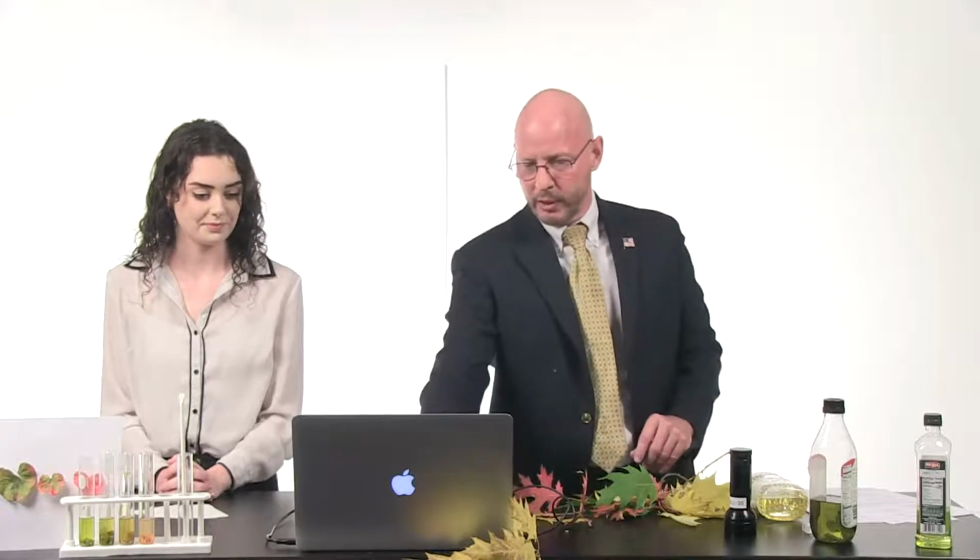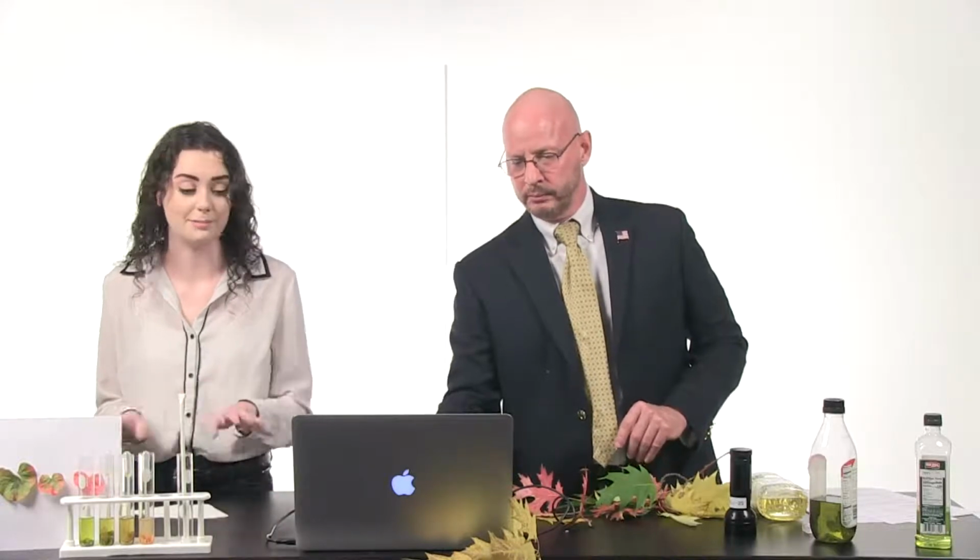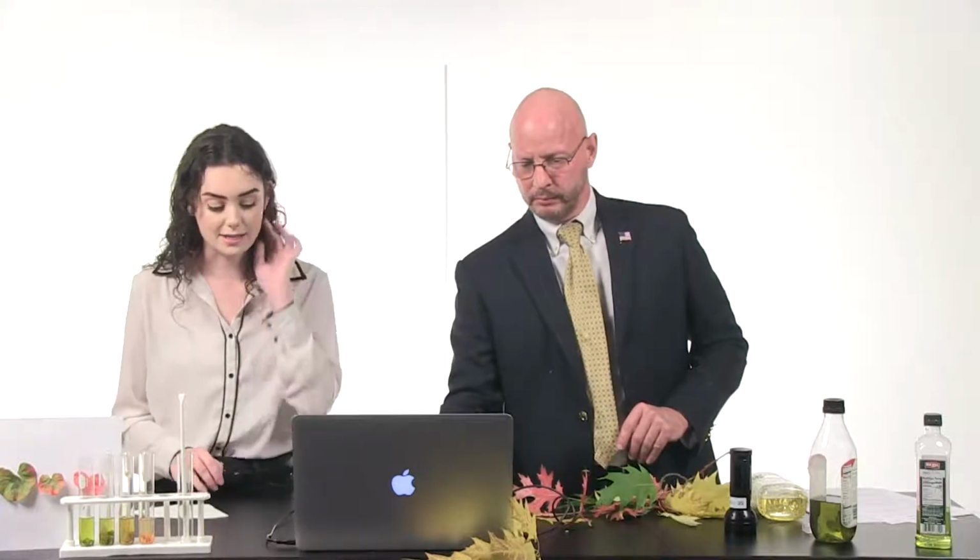So now that you've seen what I can do with these two different things, I want to go back to Mackenzie and take a look at what she's able to do with some of her stuff. So Mackenzie, what are you thinking you can do here? Yeah, this is my favorite part of the fall season, doing experiments with leaves. This is my favorite, by far, coolest part of doing it. And with the spectrometer, it's really easy. You can take it anywhere you want. I did this experiment at home.